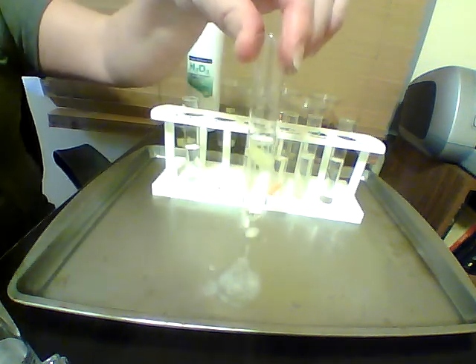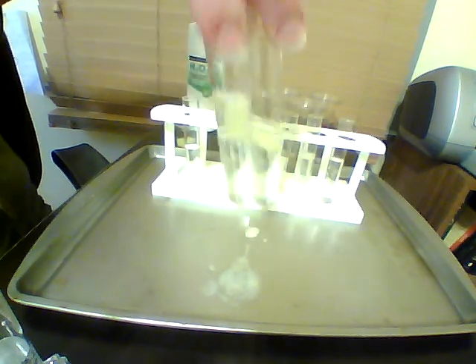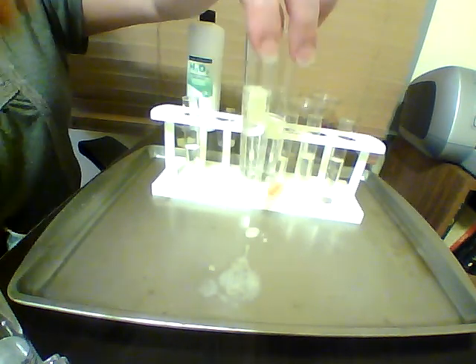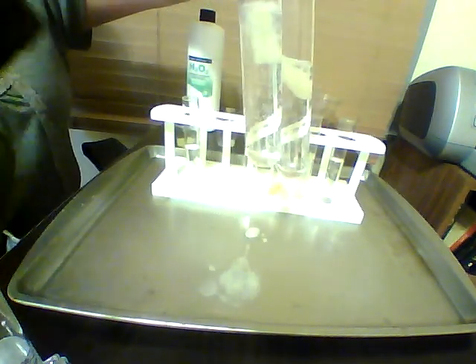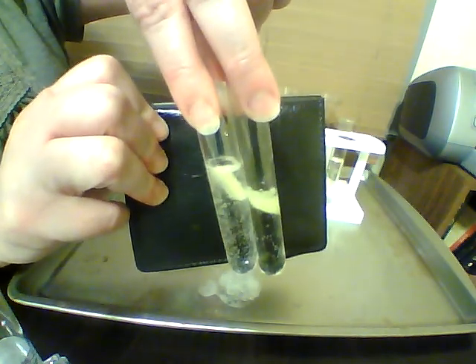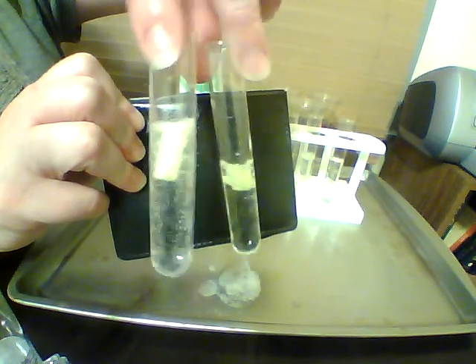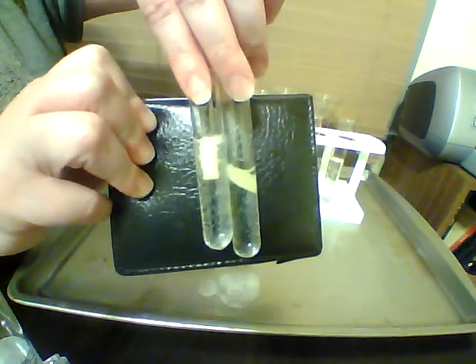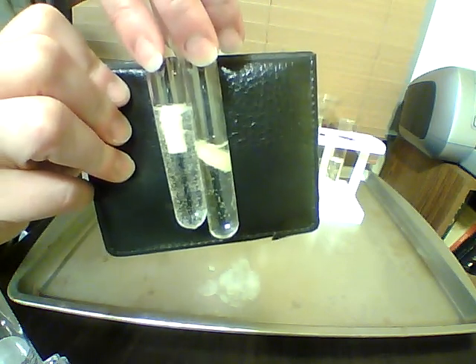This is our pineapple. So we have our cooked pineapple and our raw pineapple. Let's see if I can get these to where you can see them on the camera pretty good without a glare. That's a little better. So we have our raw here and our cooked here. And you can see that the raw doesn't have a ton of bubbles in it, but the cooked has even less.